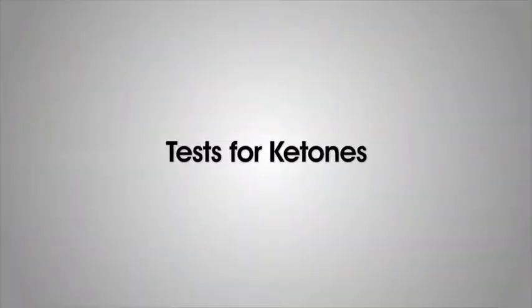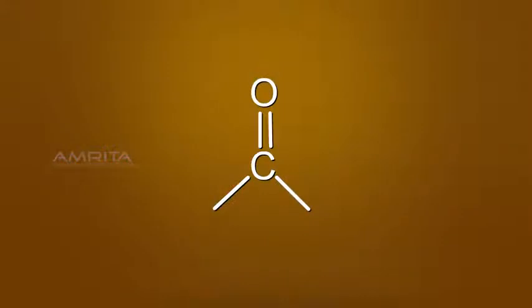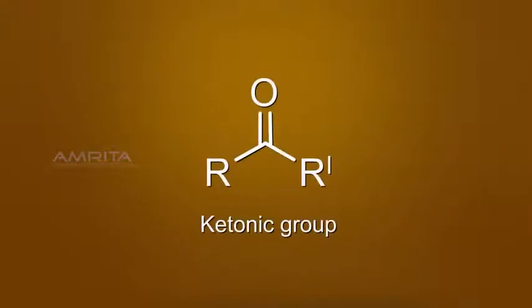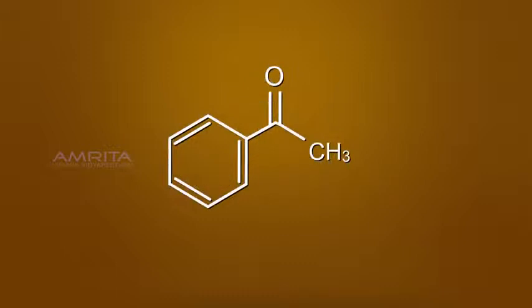Tests for ketones. Ketones are organic compounds containing the ketonic functional group in which the carbonyl carbon is attached to two R groups. The R groups may be alkyl or aryl groups.